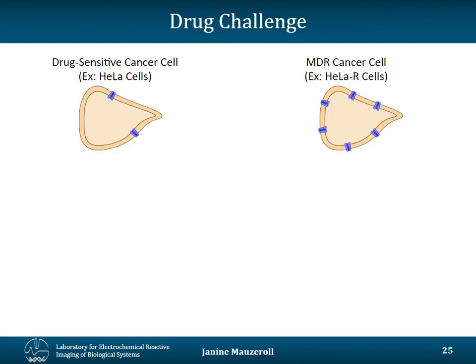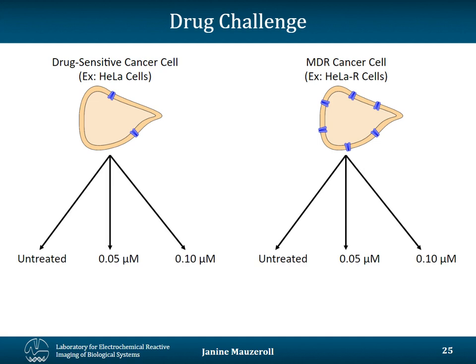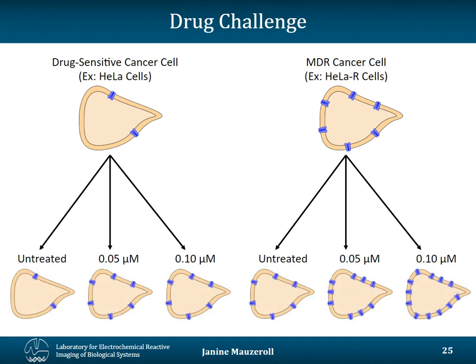So we wanted to see if SECM could be used to monitor the functional activity of these transmembrane proteins. And so we drug challenged the cells. We drug challenged cells that were not resistant on the left-hand side and cells that were resistant. So we generated a population of cells that had different MDR phenotypes.